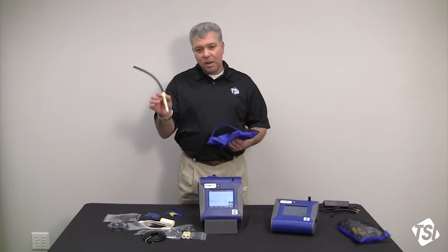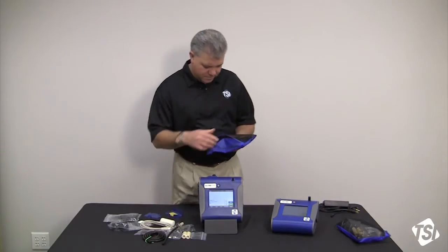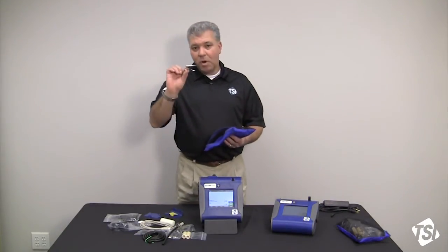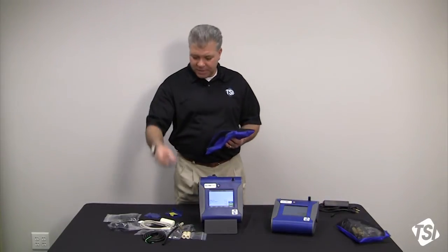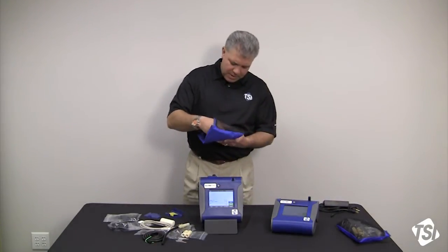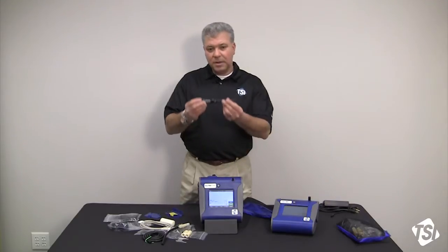You get a dorr-oliver cyclone — a small tool to pull the 37 millimeter filter cassettes apart with. And then last but not least, your spineer tool.